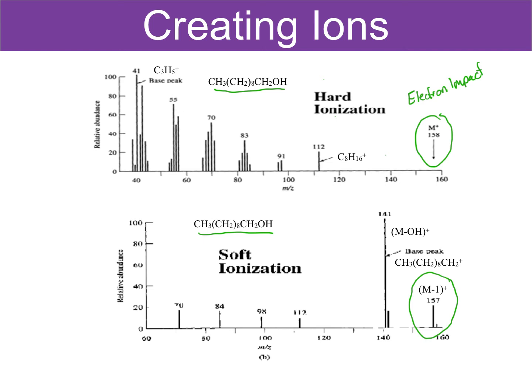Our base peak is just missing this alcohol. Whereas the base peak in hard ionization is missing pretty much everything except part of the carbon chain.